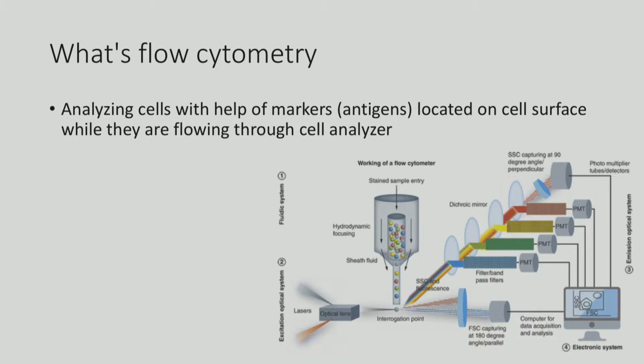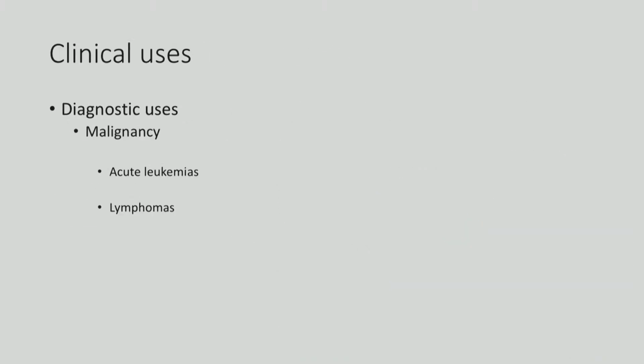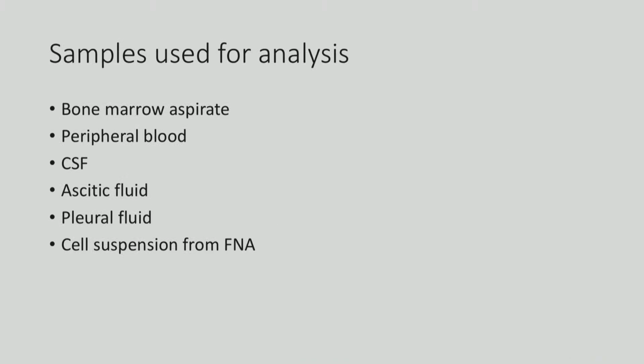The basic model has been explained by Shashidhar sir. What samples do we use when we order the flow cytometry test for a diagnostic purpose? The commonly used sample is a bone marrow aspirate for all the hematolymphoid malignancies. Peripheral blood also can be used for a diagnostic purpose.